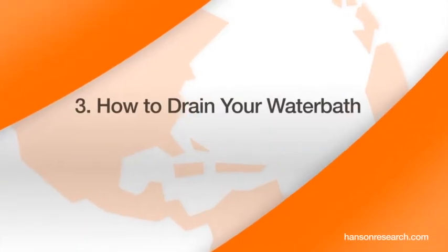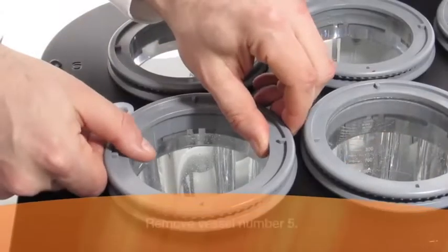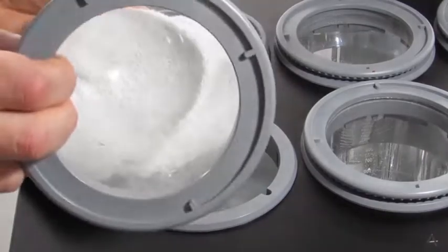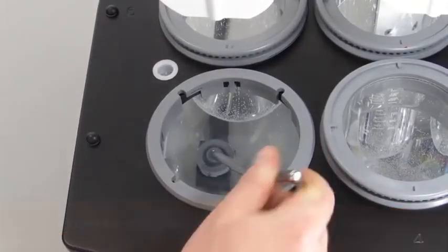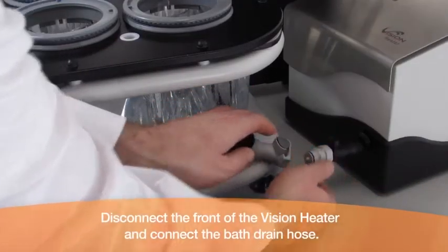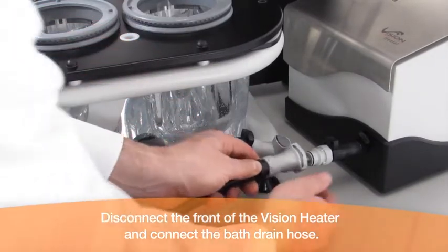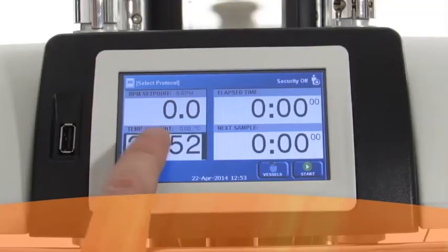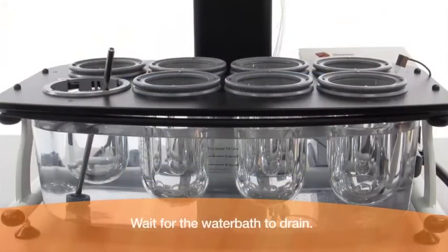How to drain your water bath. Remove vessel number 5. Insert the drain plug into the water bath output fitting. Disconnect the front of the Vision heater and connect the bath drain hose. Turn on the pump. Wait for the water bath to drain.